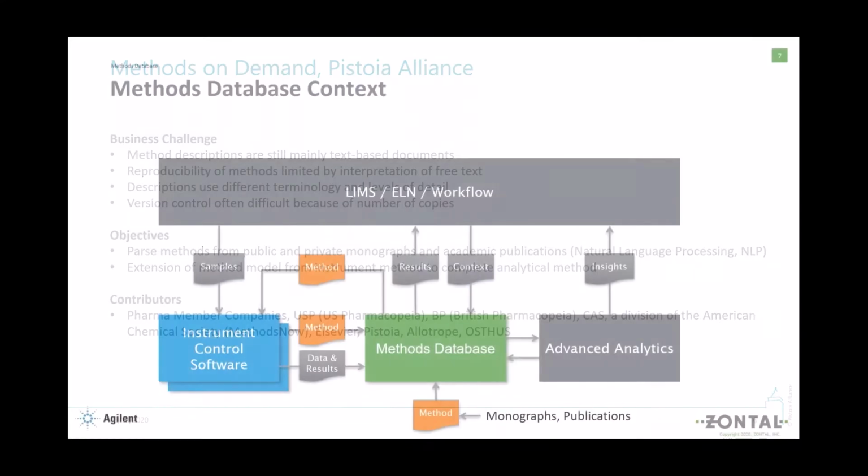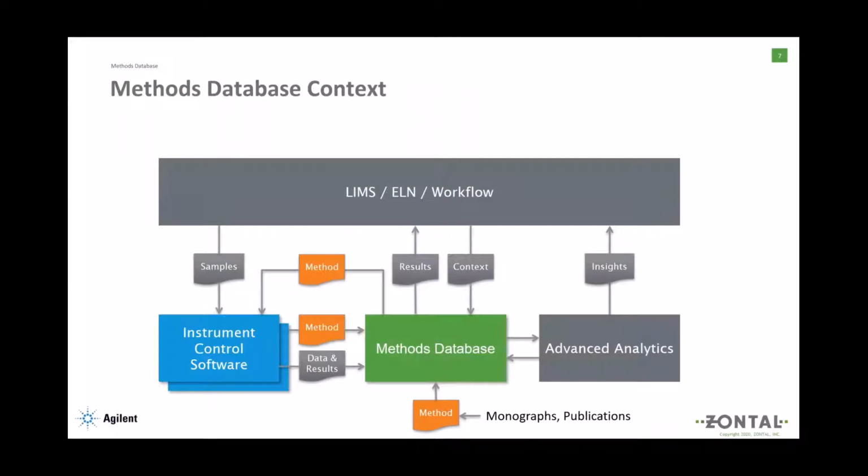So if we put these two workflows, using a digital method and creating a digital method, into a wider context, we will have the instrument control software that is consuming digital methods or using the editing capabilities, also producing digital method. So this is a part that we will present live today. And then the second input part would be this new project that I just mentioned, where we will parse out methods from monographs and publications.